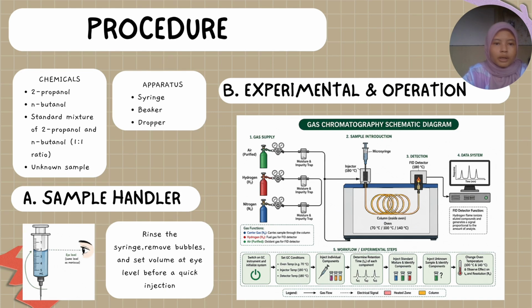The individual standard compounds are injected first to determine their retention times. Next, the standard mixture is injected, and the peaks are identified by comparing their retention times with those of the pure compounds. Finally, the unknown sample is analyzed to determine the components present.